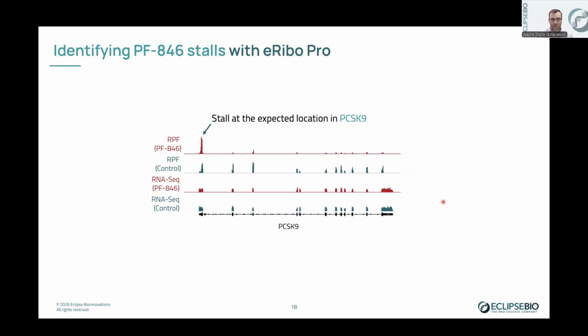And we have developed an algorithmic approach that allows us to screen across the entire translatome and identify these stall sites statistically. So even if you don't expect that your drug could be affecting stalling, our analysis can capture that to give a wider view of what's actually occurring. We also can do that between different disease conditions as well to see how stalling patterns change.